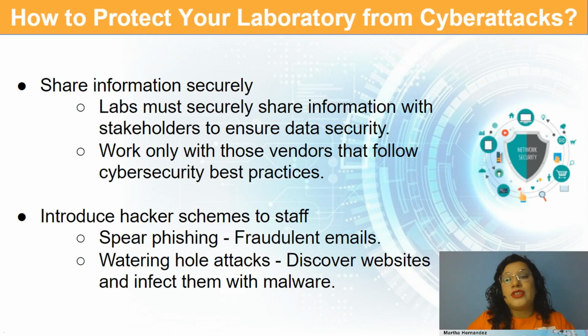A laboratory shares data with interested parties internally and externally. Labs must securely share this information with some stakeholders to ensure data security. Labs should preferably work only with those vendors that follow cybersecurity best practices. This can be difficult because not every vendor follows these best practices. So the labs must introduce hacker schemes to the staff. They have to be familiarized with this type of practices.